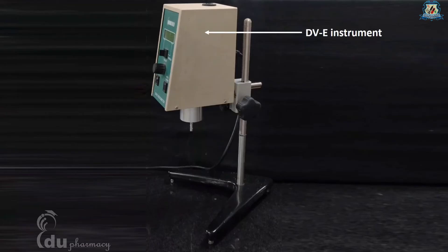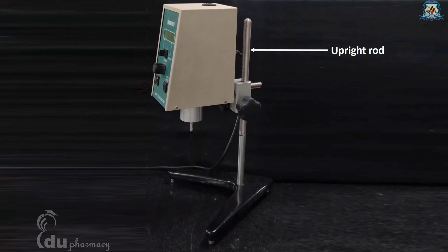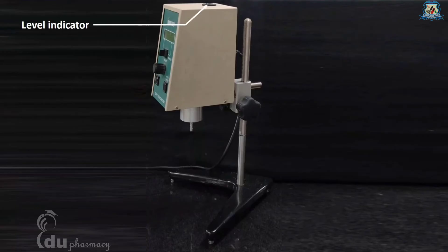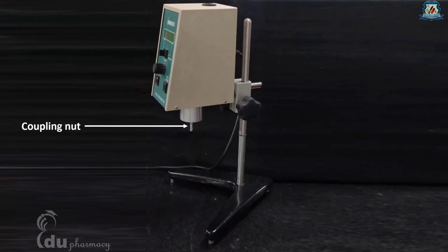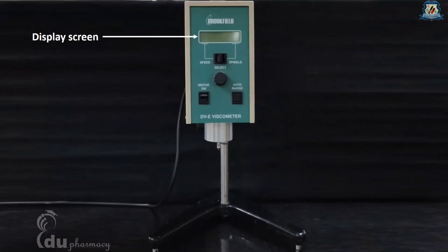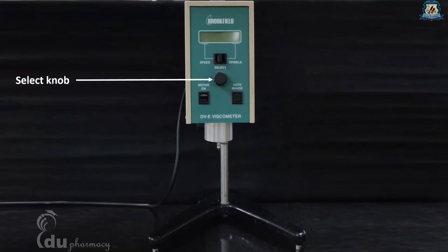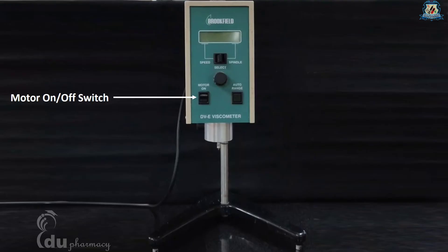Here is the DVE head part attached to the upright rod by clamp assembly; the rod is fixed on a base. A gear screw is provided which allows up and down movement of the head part of the instrument. At the top of the head, a level indicator is given, and at the bottom a coupling nut is provided to which we can attach a spindle. On the face of the DVE instrument you can see a display screen, speed/spindle switch, select knob, motor on/off switch, and auto range switch.